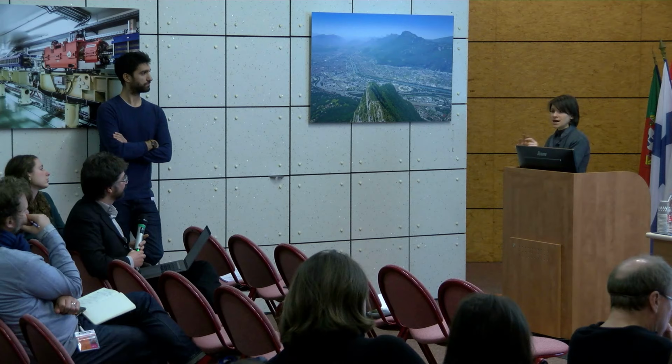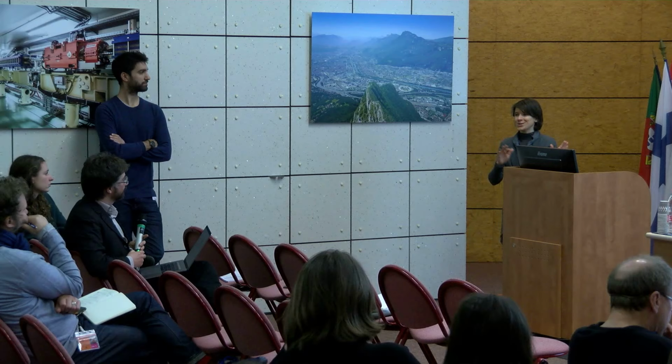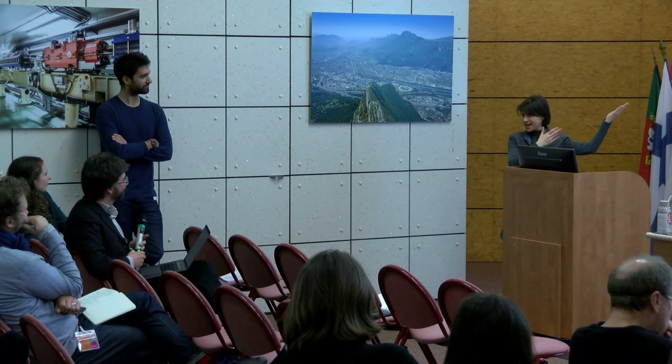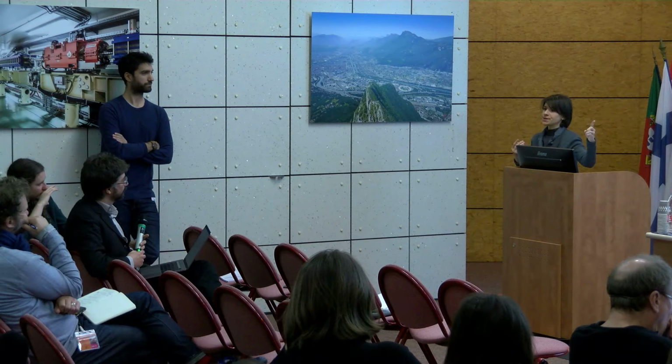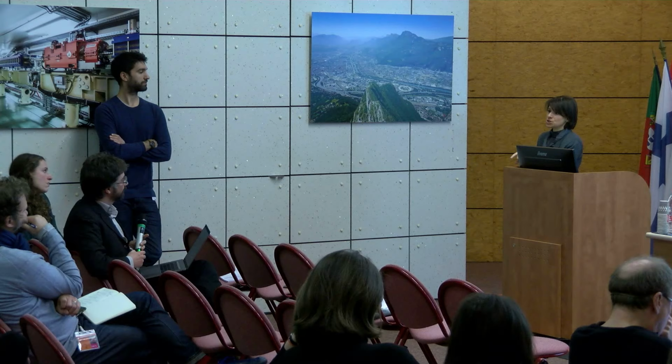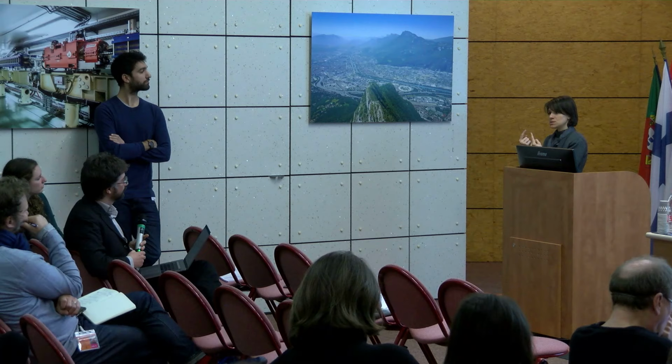So we started the experiment and we said, okay, here we don't have a focused beam, so we can be sure that nothing will happen. And at the end, we observed a big damage. And by comparing the fluence values that we recorded at ID21 when you work with the micro beam but under vacuum condition, we realized that by using similar fluence values at ID26, we observe damage while there, no.